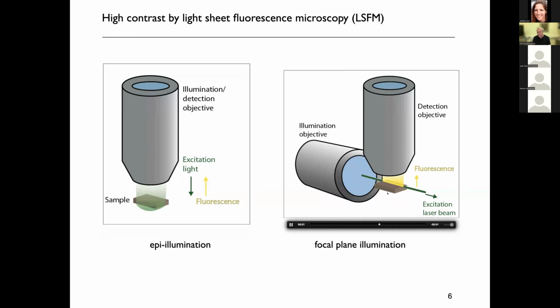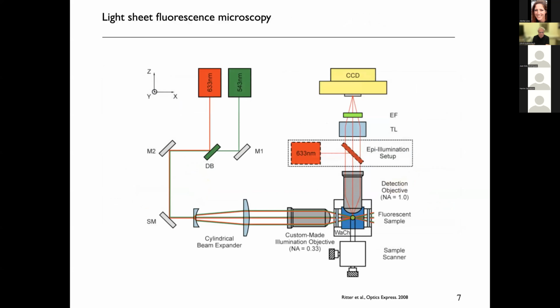And fluorescence is detected then perpendicular to the illumination direction, either in top direction or bottom direction. So this is the principal idea, which then can be refined to achieve new features. So the basics of the instrument still is usually more or less principally the same.